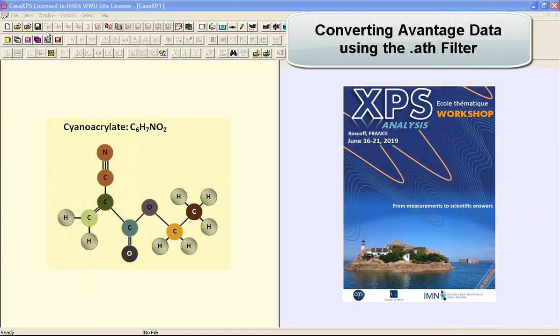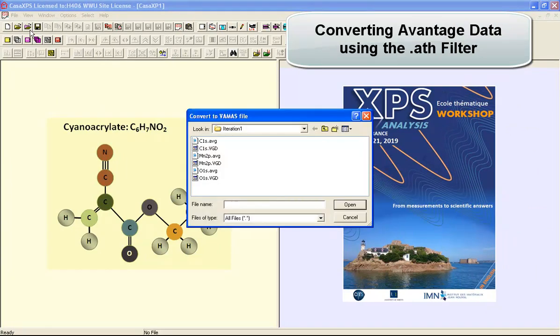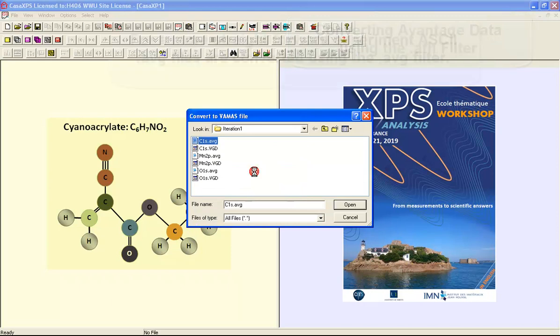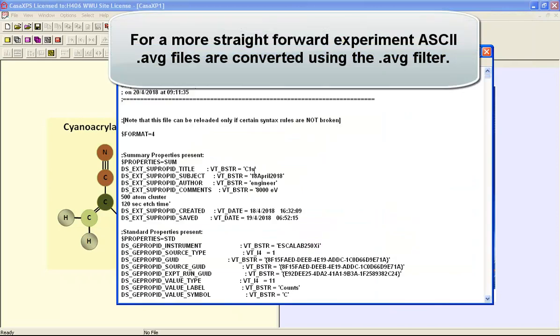In this video we're going to look at Avantage data and converting Avantage data from an AVG format. In this instance we have data that have been acquired in an intricate sequence of measurements.